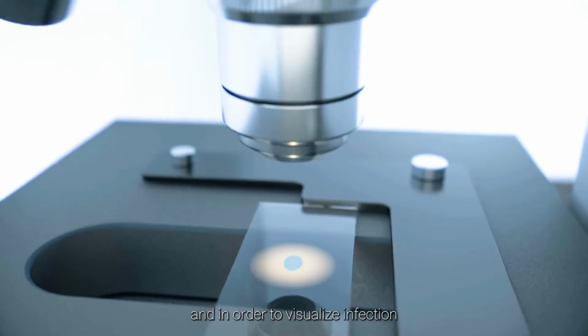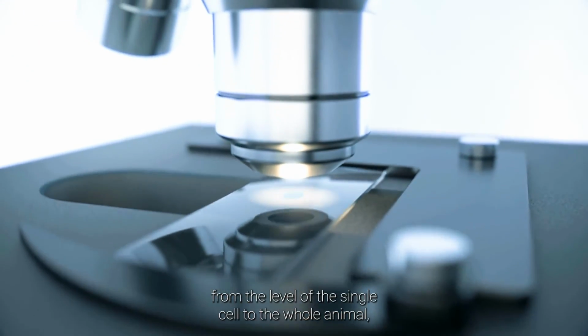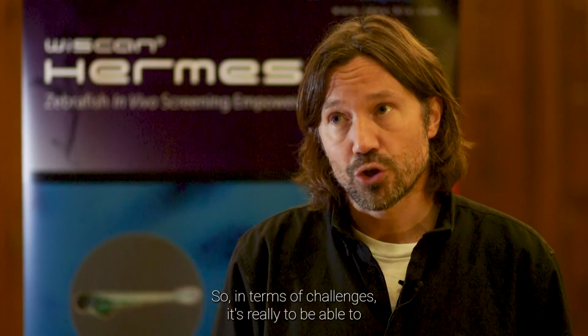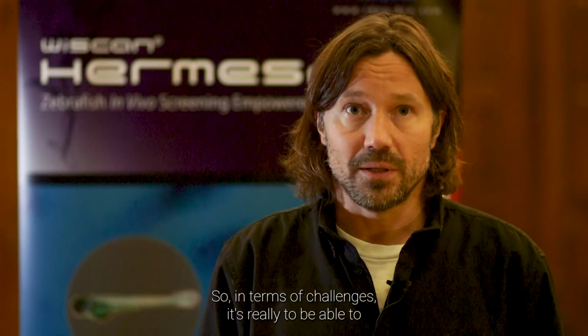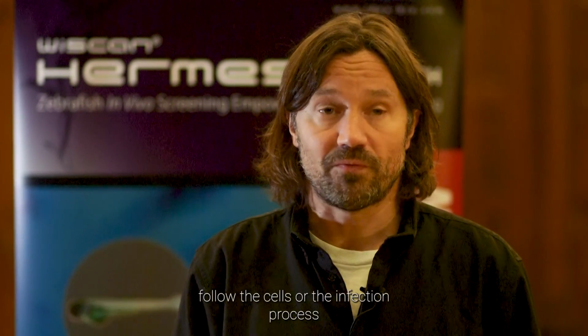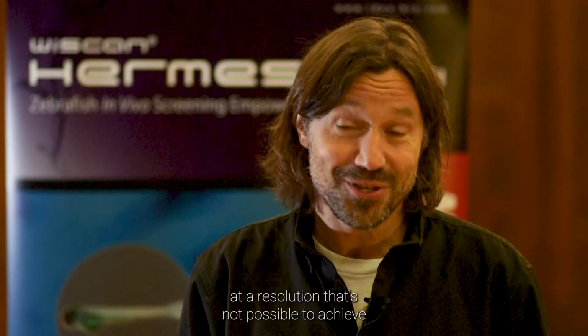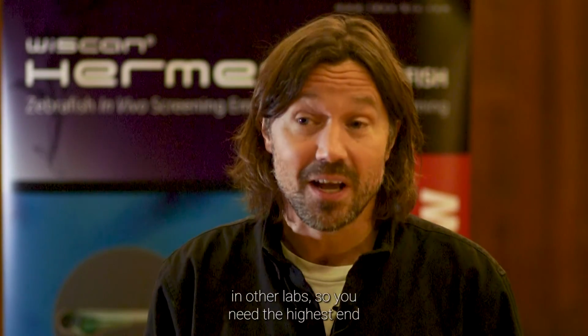And in order to visualize infection from the level of the single cell to the whole animal, we use the zebrafish larva. So in terms of challenges, it's really to be able to follow the cells or the infection process at a resolution that's not possible to achieve in other labs.